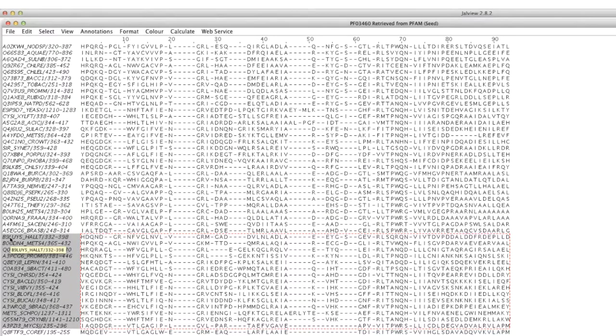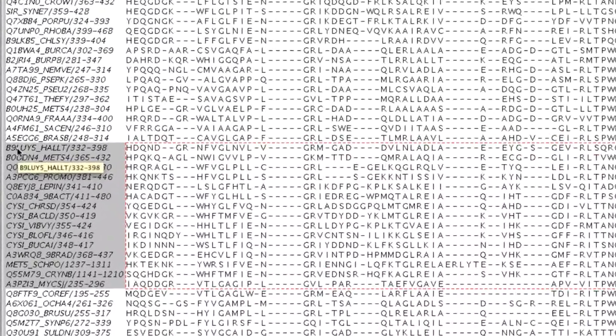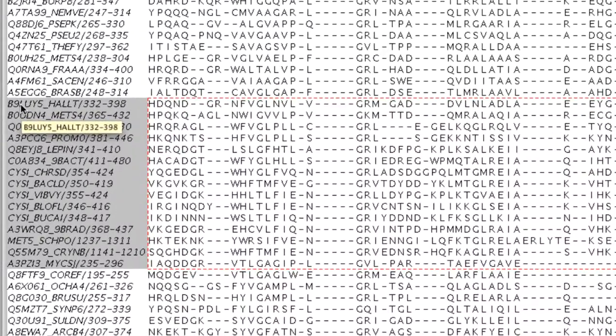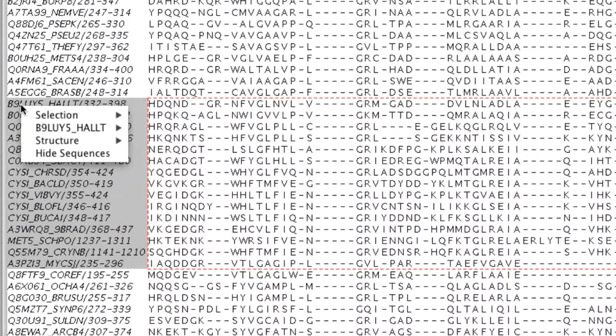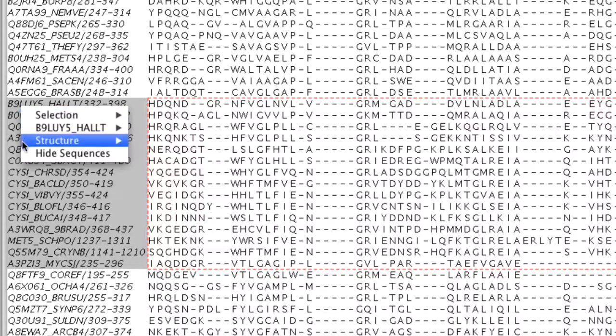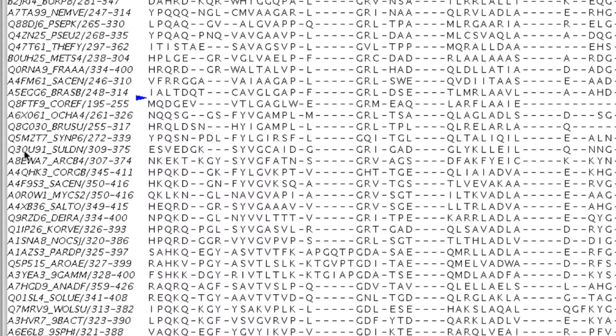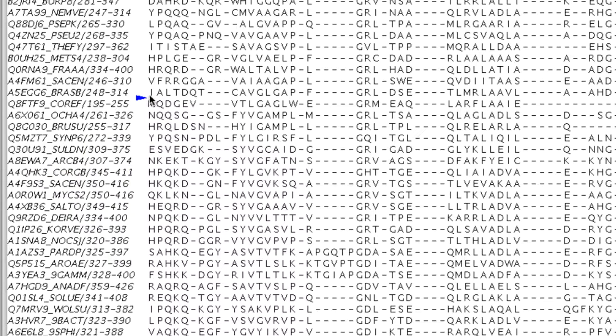To hide a set of sequences, I select the sequences in the Sequence ID panel. Then I right click the mouse, which brings up the pop-up menu, and I select hide sequences. They are concealed, and the location of the sequences is indicated by a small blue triangle.